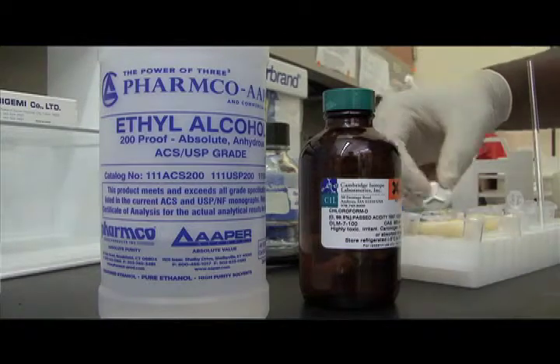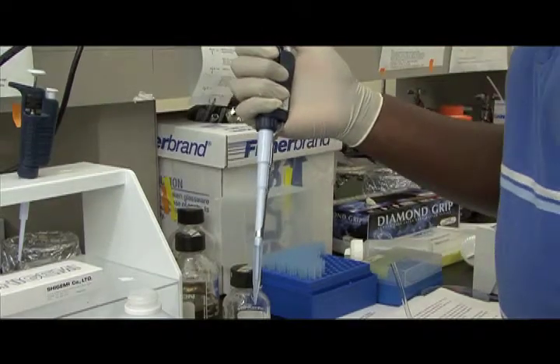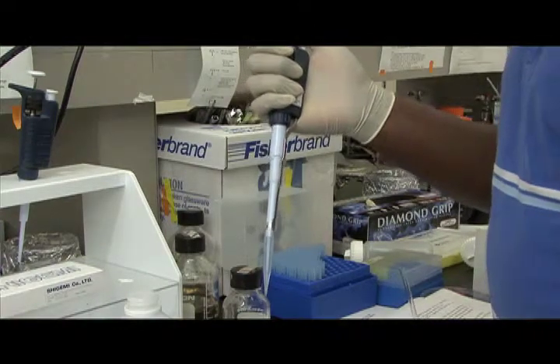proteins with their partners in and around cells, and this includes collagen and elastin fibers that are major parts of our body. One of my colleagues likes to liken NMR to a Swiss Army knife. It's got lots of blades. You can do lots of different things with it. It's lots of different tools in one.